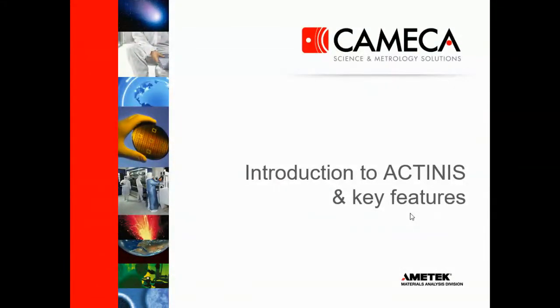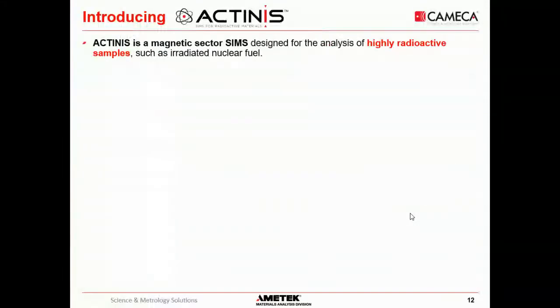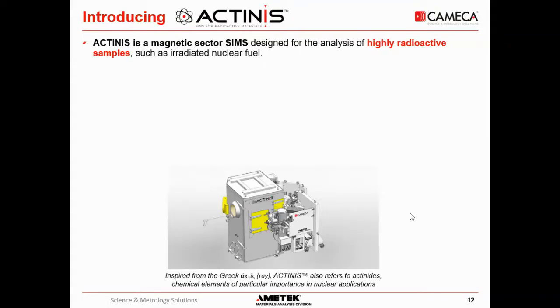So let me switch now to ACTINIS. ACTINIS is a magnetic sector SIMS, which has been designed for the analysis of highly radioactive samples, typically irradiated nuclear fuel. We can see here a 3D view of ACTINIS. The name ACTINIS is inspired from the Greek actis, which means ray. But it also refers, of course, to actinides that you know very well, so elements which are very important for nuclear applications.